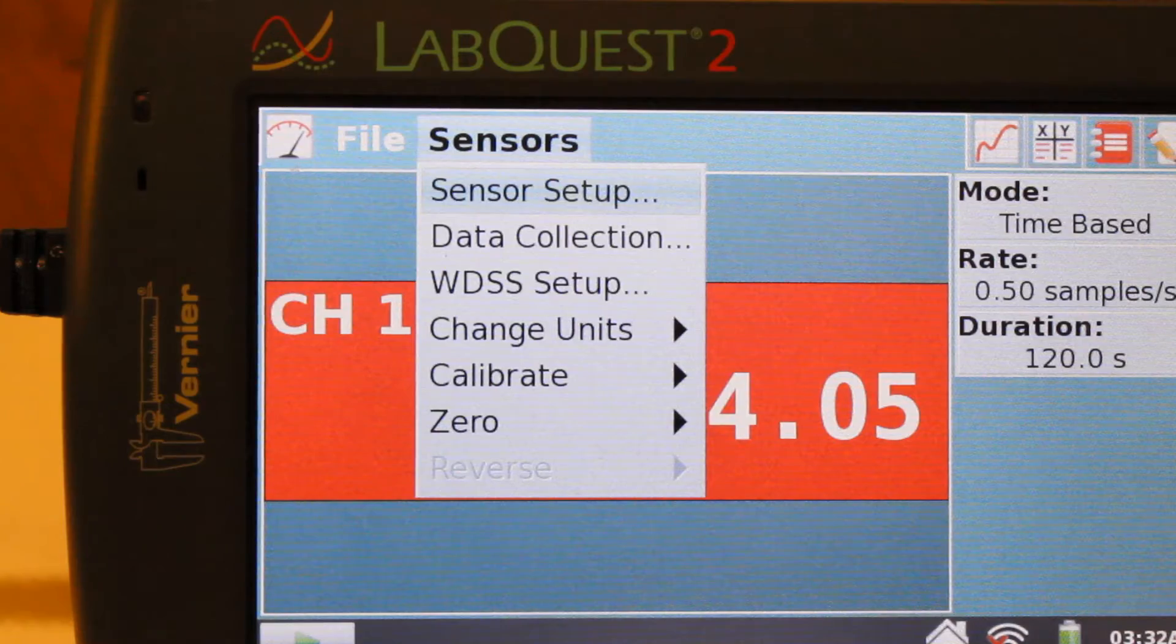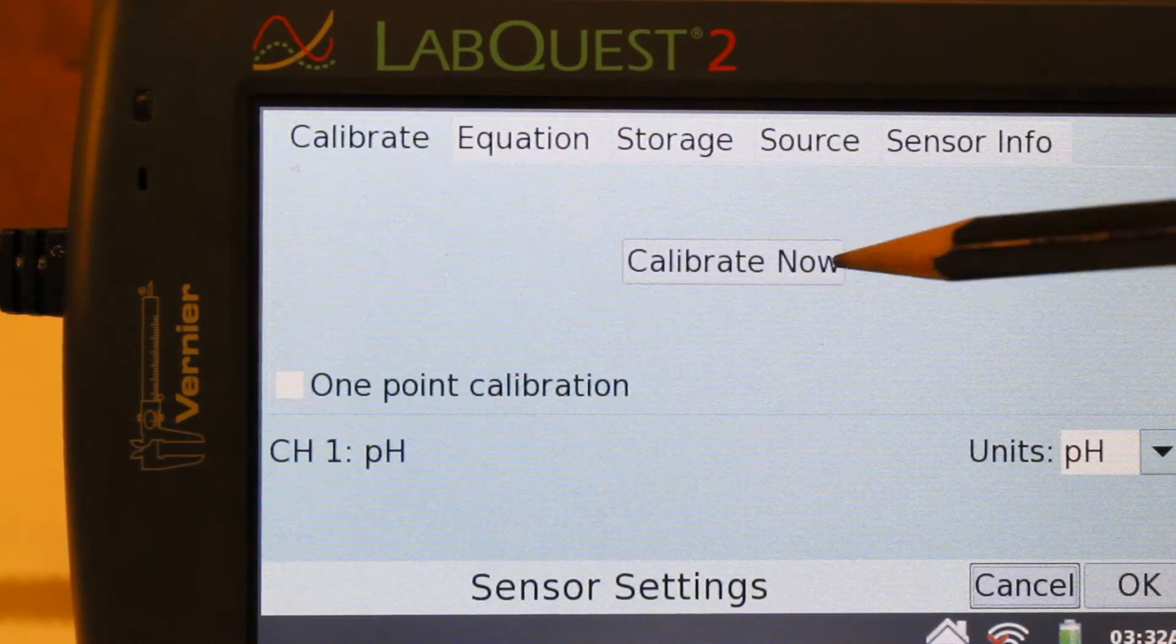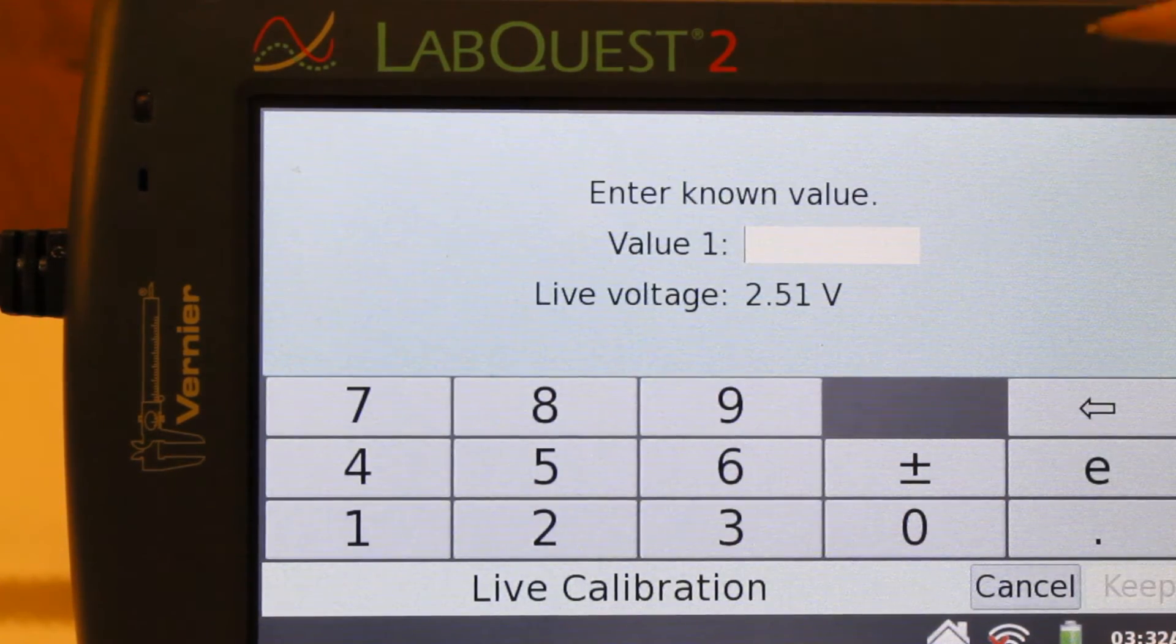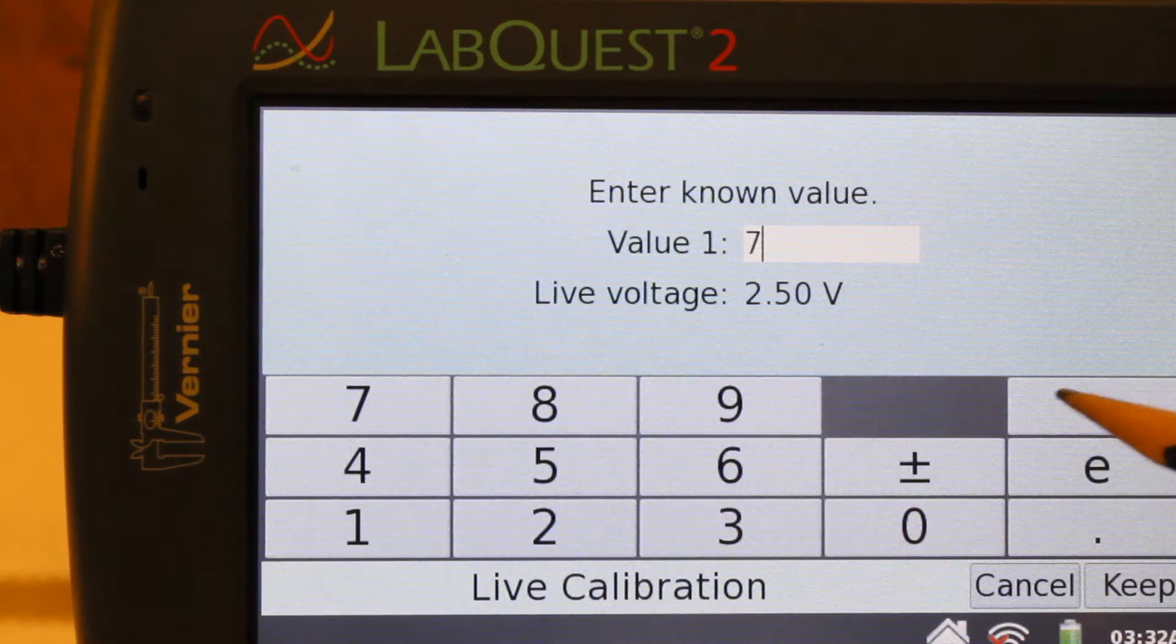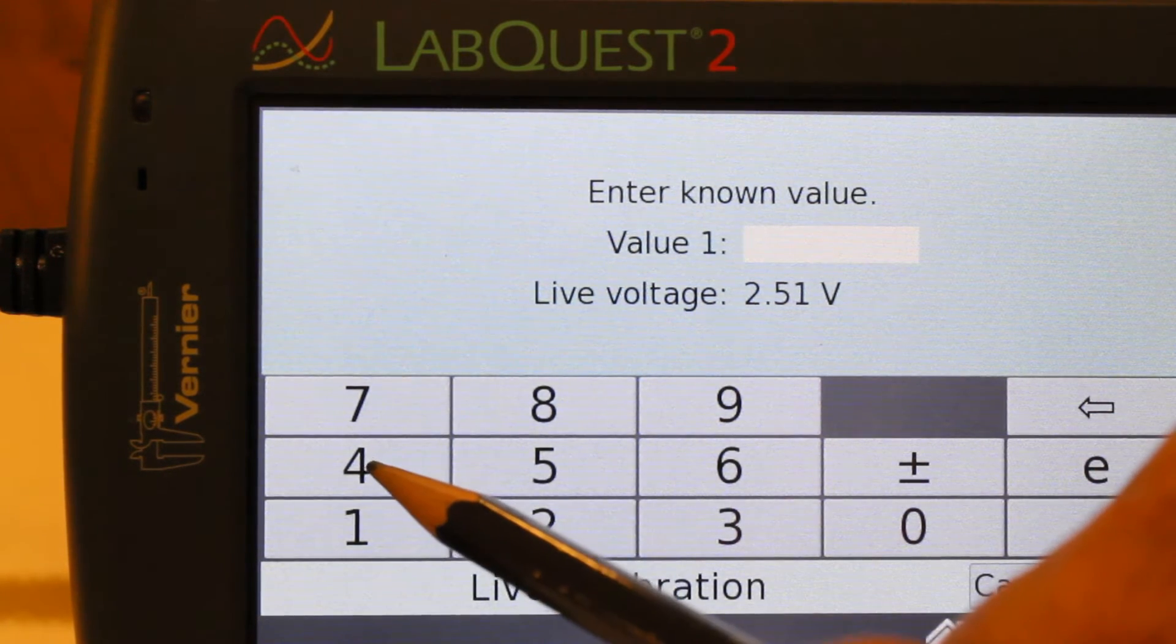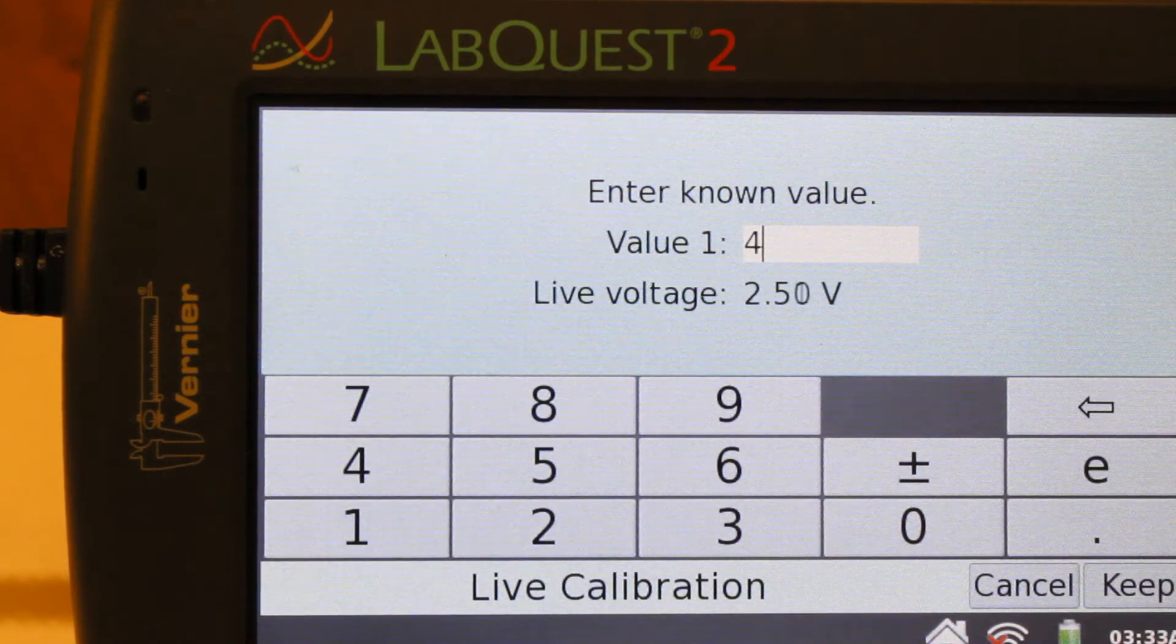Next, select sensor, calibrate, pH, followed by calibrate now. Now you should enter known value. This is the value of pH of the buffer solution, in this case it is 4. Select keep.